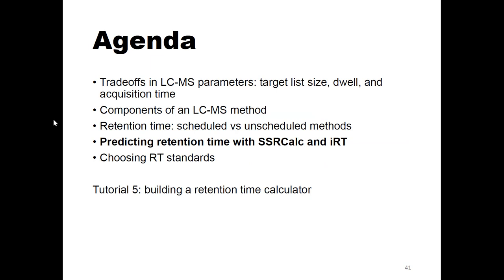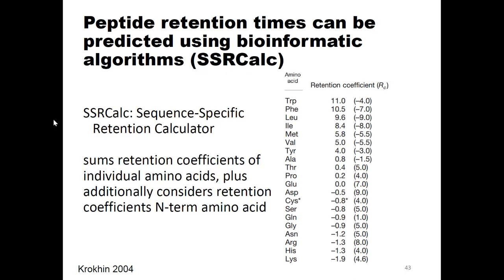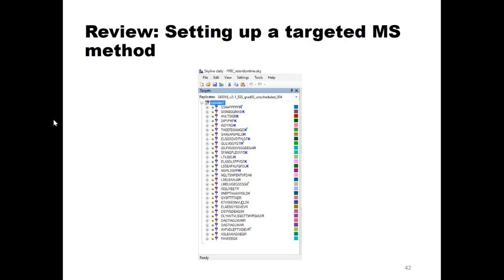We're going to go pretty quickly through how two methods calculate retention time. Just to bring you back and orient you again, this is the left-hand side of your Skyline pane, the target list. Here's a whole bunch of peptides in my target list. Let's say I wanted to know what their retention times were.